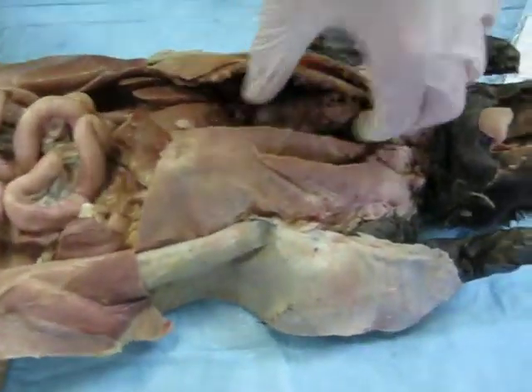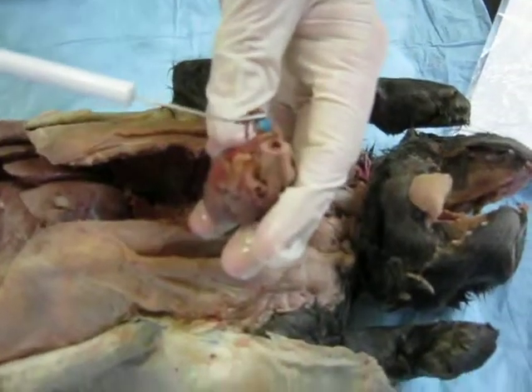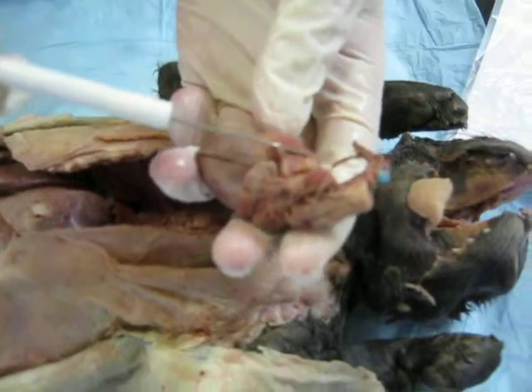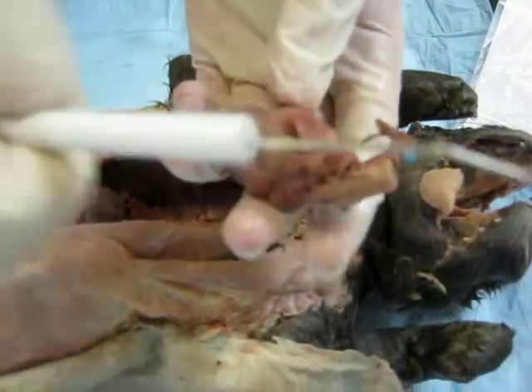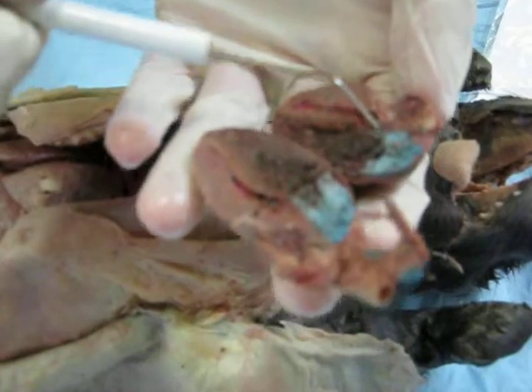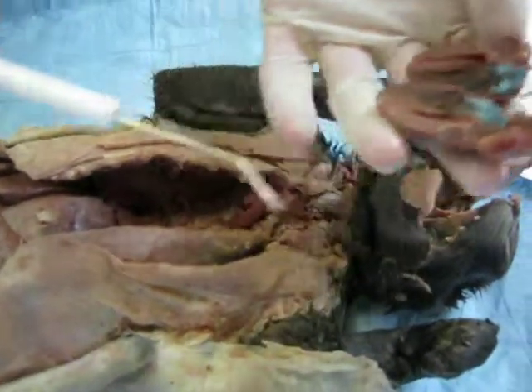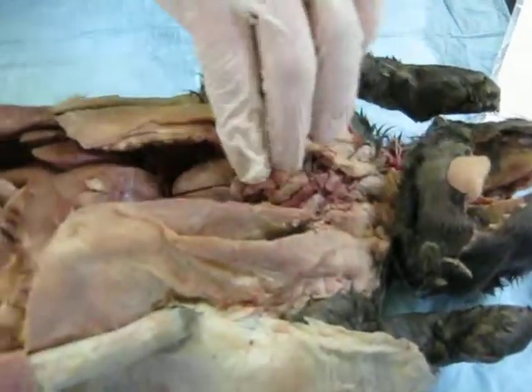For our heart, we have the vena cava and the aorta. We have here on this side the right atrium and then the right ventricle, and I can open that up here. Right atrium, right ventricle, and then we have the left atrium and the left ventricle, basically on the inside of the heart, and that basically covers the whole dissection of the cat.